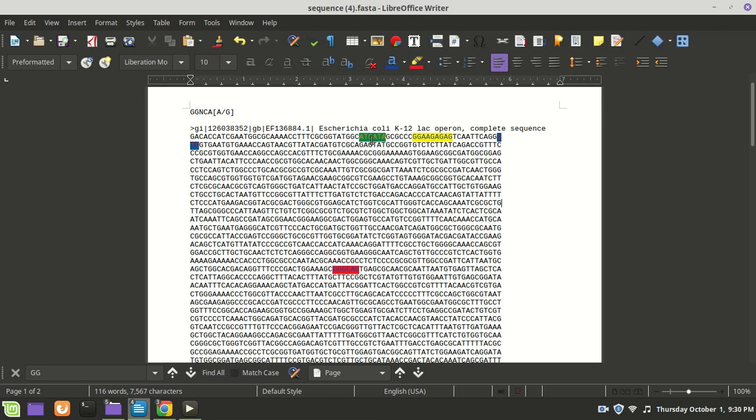And then we'll go to TATA boxes and things like that, and terminators and other sequences that we're interested in, like O and cap and all of those. We'll do those later, but let's first find where Z, Y, and A are. Here I give you where I is. We'll also need to find the terminator. This is the TATA box. There is a termination sequence in here. That's a little harder to find, and we'll do that one later.